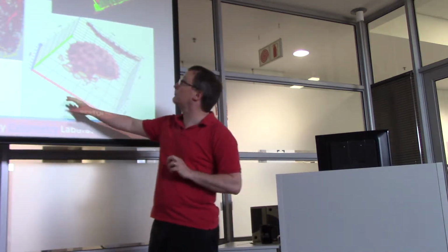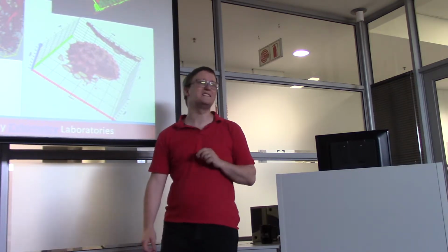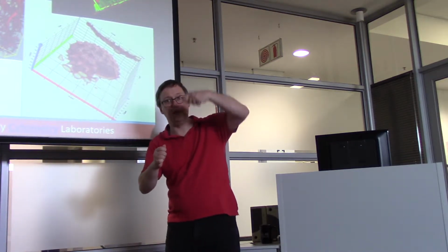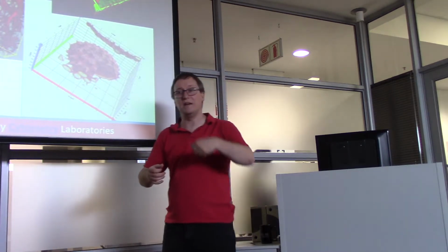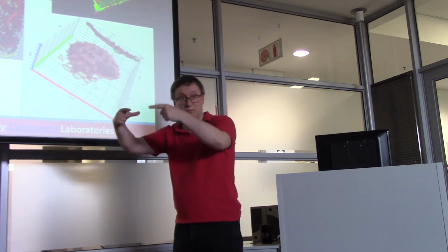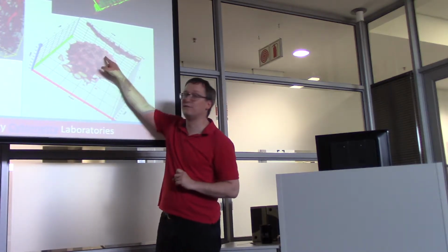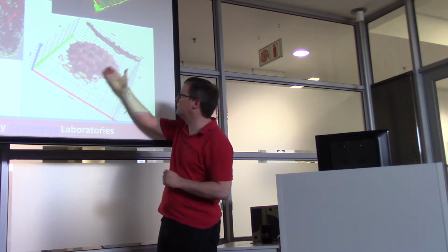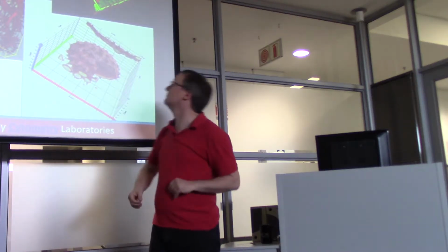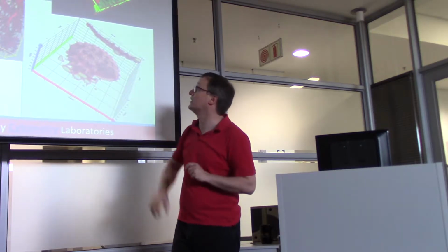All right. Now, 3D reconstruction is a very big example of the registration problem. So what do I mean when I say a Z-stack? In this case, I have my individual fluorescence microscopy images, but I've altered how deep within the sample I'm focusing, which means that by changing how deeply I'm looking down into the sample, my images are able to capture basically thin sections of the transparent material within it, so that I can say, this cell has a volume, not just a cross-sectional area, but a volume of so much. Or this network of microtubules has this kind of connectedness. So this problem of 3D reconstruction is something that certainly requires registration very strongly.